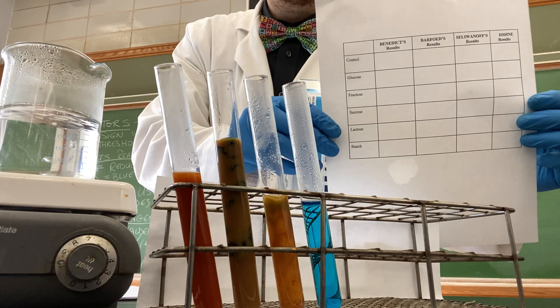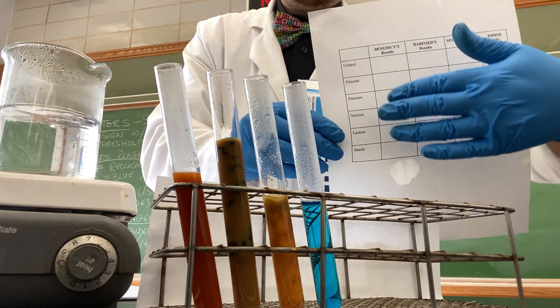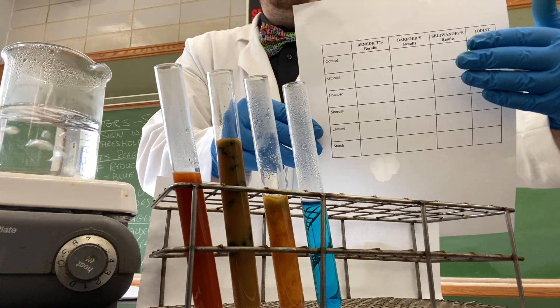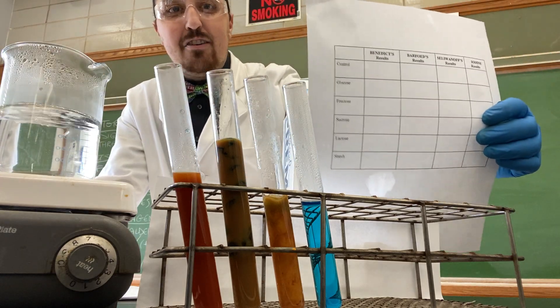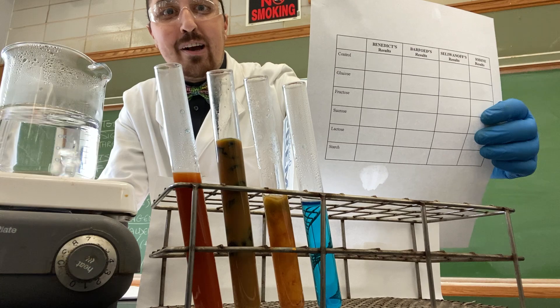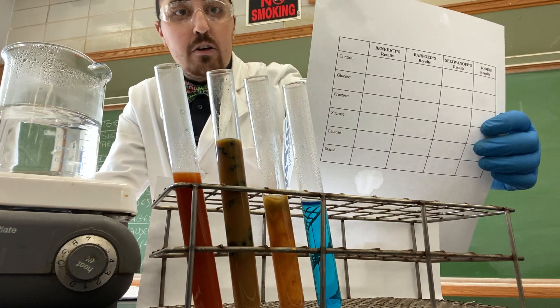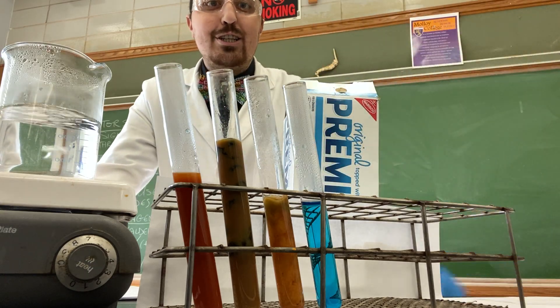You will notice on the data sheet you have the different indicators on the top and your different carbohydrates and water on the side. What you're going to do is fill in these boxes — indicate if it's a positive or a negative test by either placing a plus sign or a minus sign. Then just note the color so that you have all your observations.